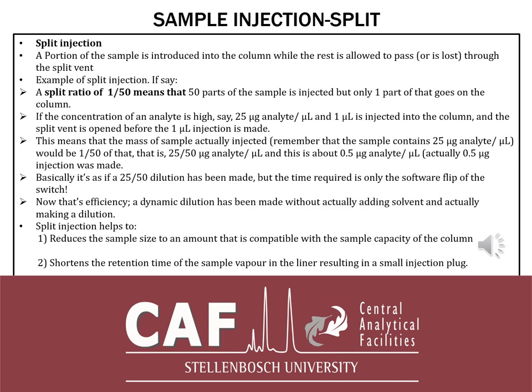Now, with a split injection, a portion of the sample is introduced into the column while the rest is allowed to pass or is lost through the split vent. An example of injection, in fact, before we go to the example, a split injection is an electronic way of diluting a sample.